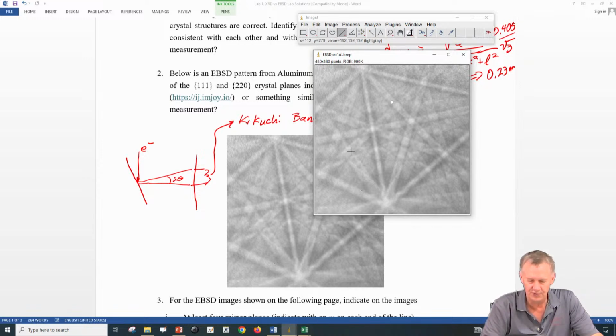You can't go further out, right, because we lose the data up here. This is a busy zone axis. It looks like there's a busy one out here, so I could believe it's a threefold. So this would be our 111. Right, that peak right there is our 111.